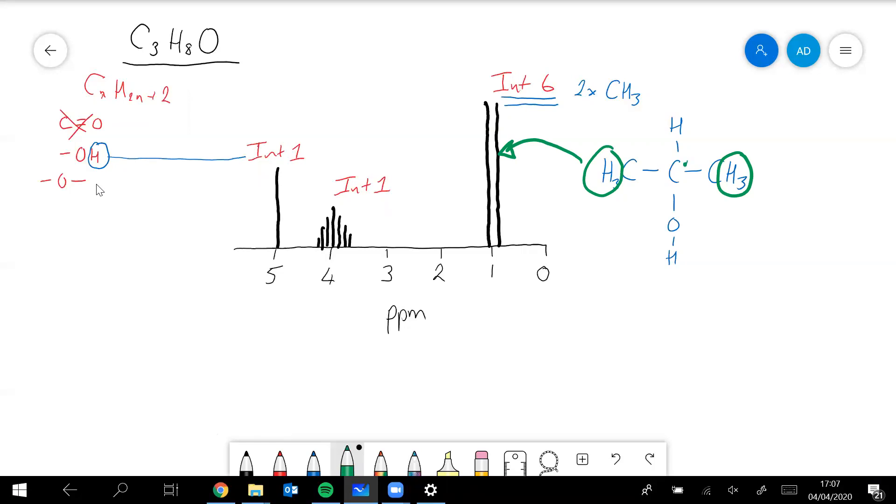The ppm value is correct as well because it's about one, and it should be because these are not near any, they're not next to the oxygen. We've already established, I think, that this is that peak there, the hydroxide hydrogen.